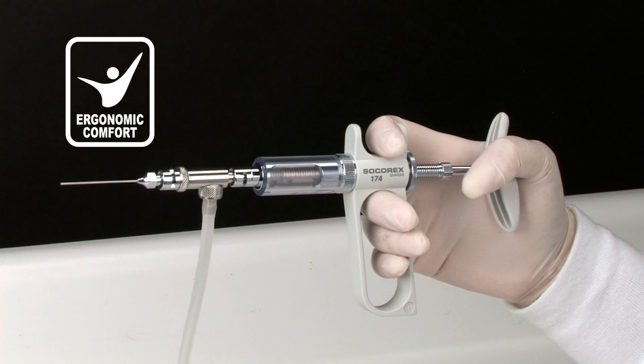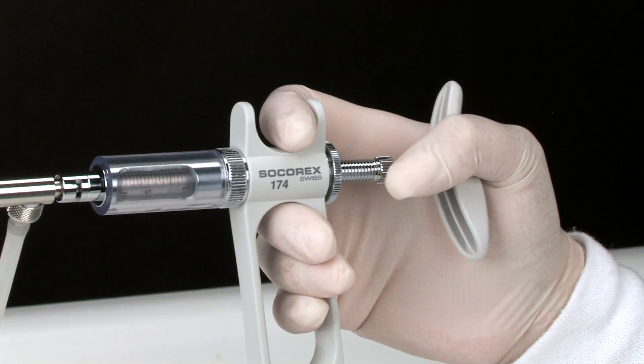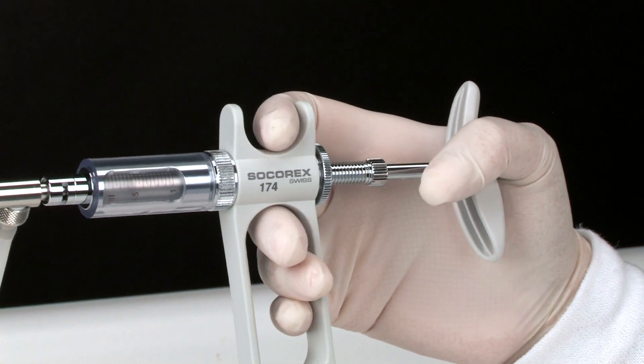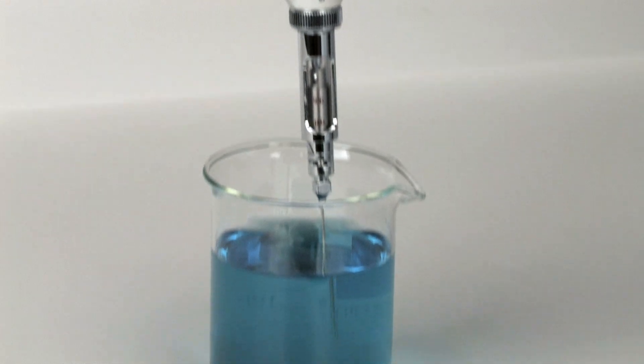All Dosus syringes are ergonomically designed to perfectly fit in any hand. Smooth activation and excellent ergonomics reduce hand fatigue. The two-ring version allows an alternative vertical working position.